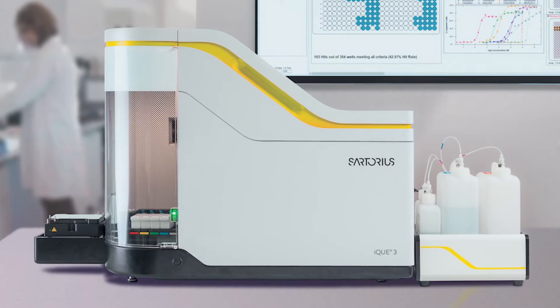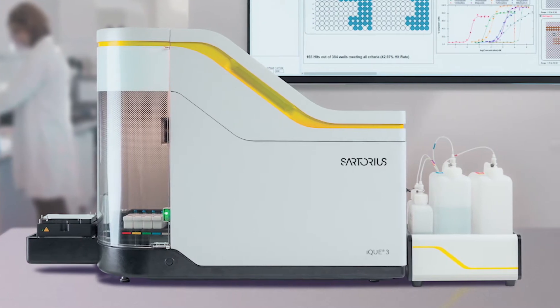Hello, my name is Kirsten McBain and I'm a scientist in the bioanalytics applications team at Sartorius. I'm here at our application centre in Royston near Cambridge in the UK, and I'll be walking you through an overview of the Sartorius IQ advanced flow cytometry platform and how it can be seamlessly integrated into your cell line development workflow.